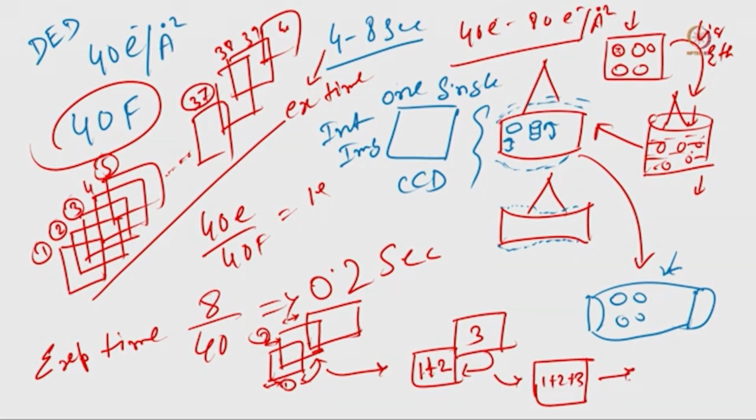Now, this integrated frame we are trying to align with frame 4, and keep doing this until we align all the frames and get an integrated image. Here I am using a very simple way to explain how we align the frames, but computationally it is a bit complicated stage.